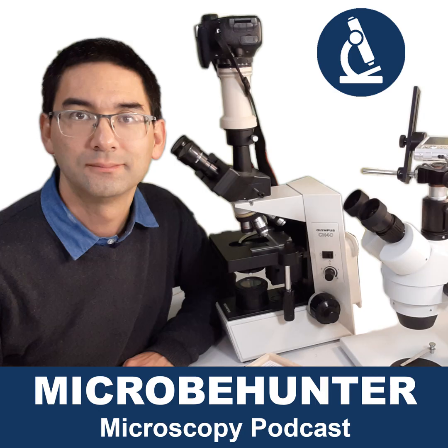Now I'm not going to talk about the improper use of a microscope, like it's out of focus or the specimen is not centered and so on. That's not really what I'm talking about here, but rather the physical limits that are imposed by a microscope or by light as such, basically the physical aspects here. And there are three points that I would like to talk about, and I'm going to go through these point by point, and I'll give you my take on this.